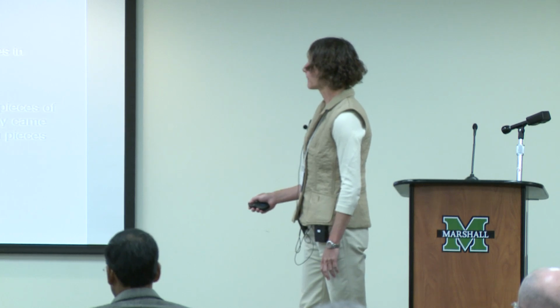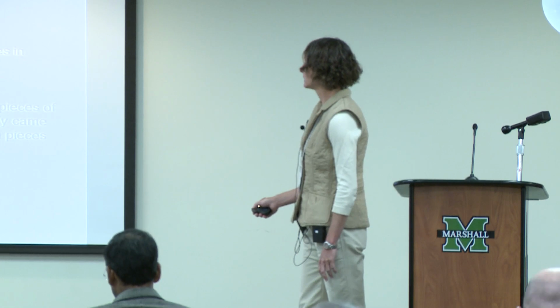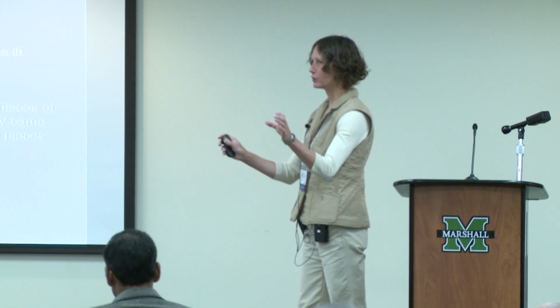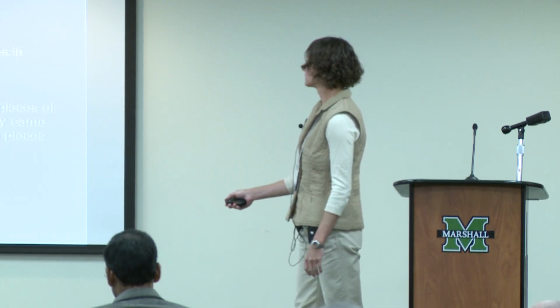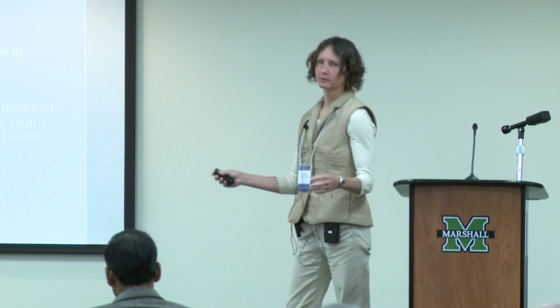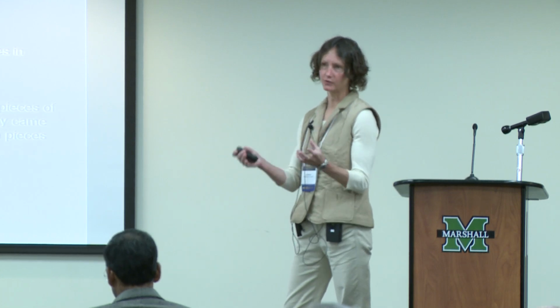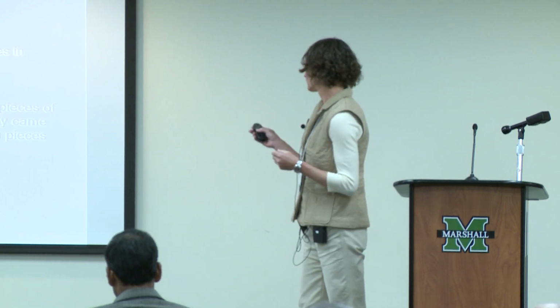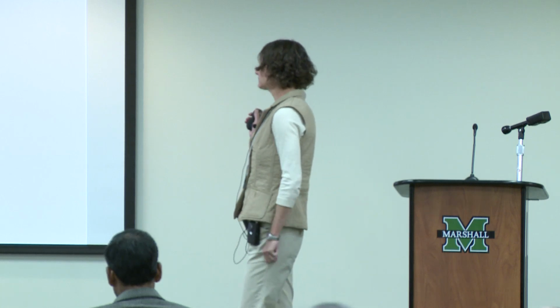And almost everyone today uses this newer shotgun method. Rather than doing it in a directed way, in which you take your genome and put it into parts, and you know where this part comes from and you sequence it first and then you do the next part, what you do here is you take your entire genome and you just shear it into little bits and mix it all together, and then you sequence individual bits randomly. I was going to give you a little analogy to War and Peace, but I don't have time for it. But I think you can see if you start thinking about that.